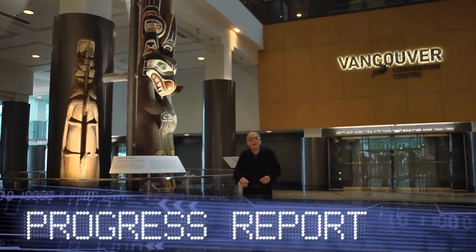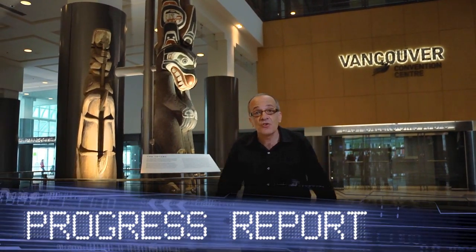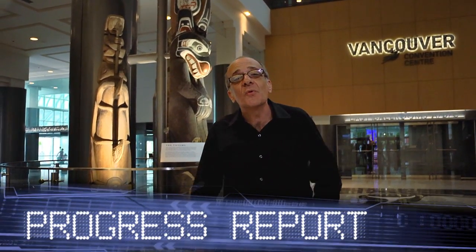The greatest minds in mass spectrometry have come to Vancouver, British Columbia for another ASMS show. Welcome to the World Tour of Innovation.